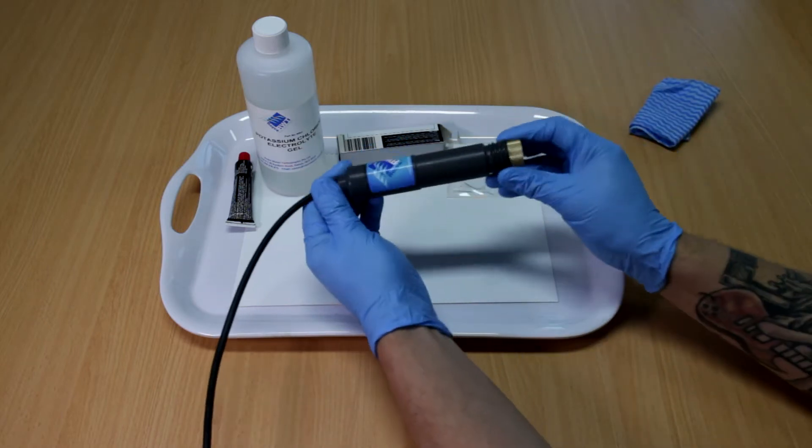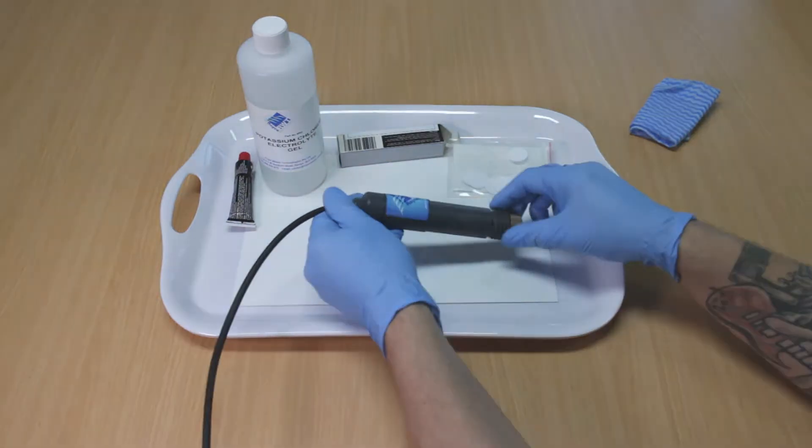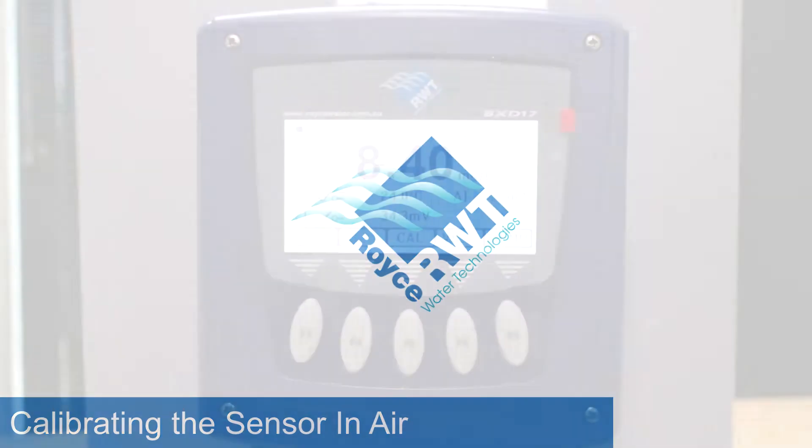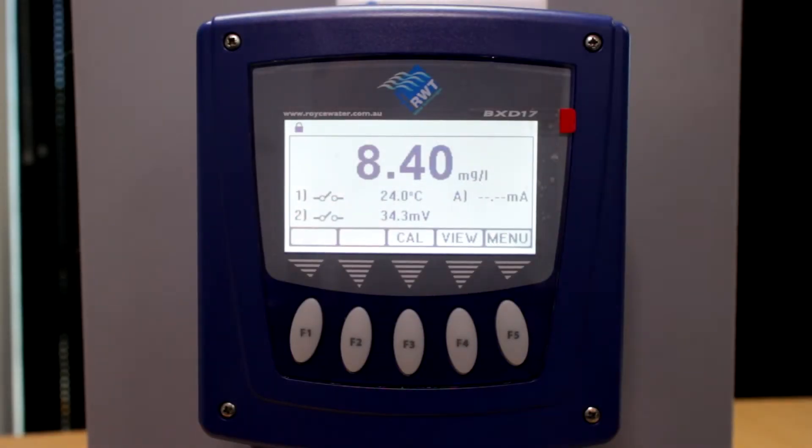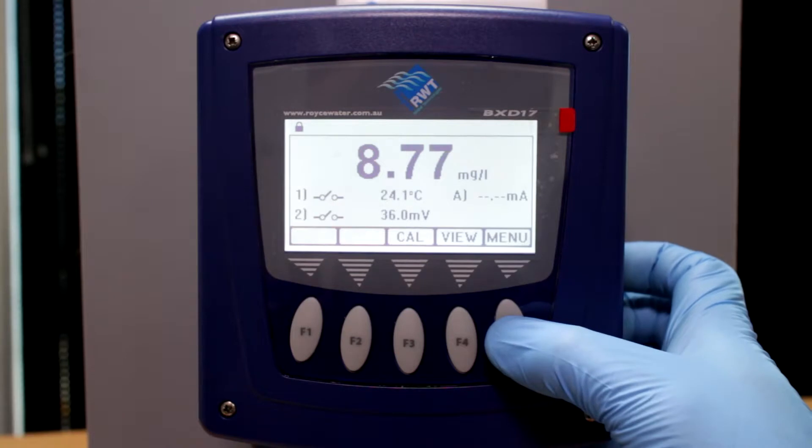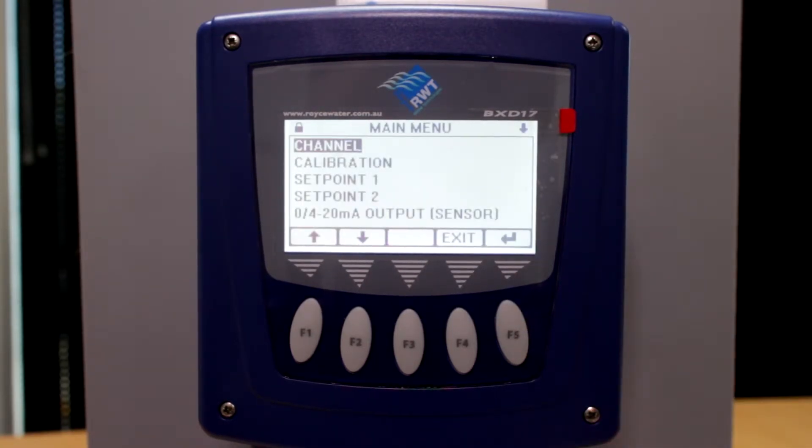To calibrate your newly charged Royce G95A dissolved oxygen sensor, first ensure that the probe is placed in free air and out of direct sunlight. Push F5 on the front screen - this will take you to the menu.